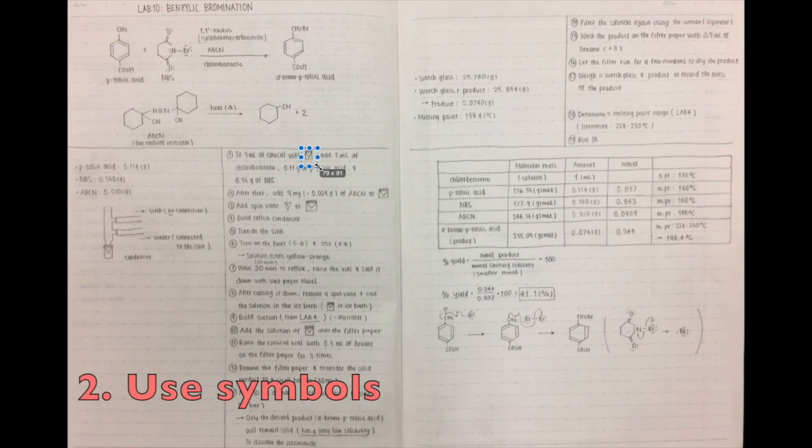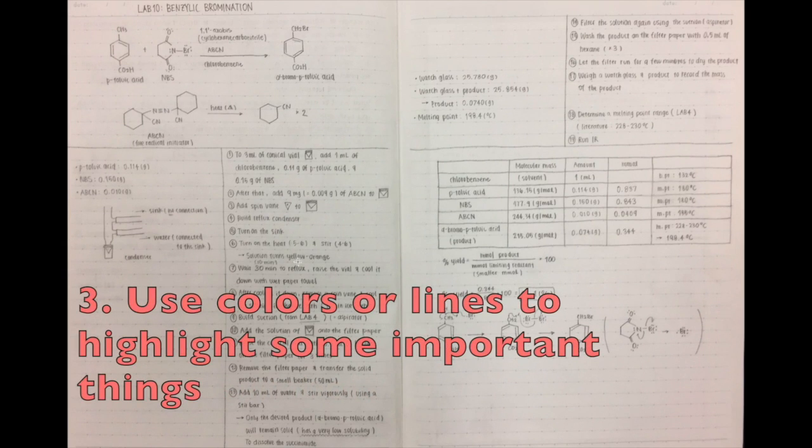Also, use some symbols in the notebook as written here. This makes the lab notebook more concise and easy to read. Finally, on this page it's not used, but it's a good idea to use several colors to highlight some important steps or ideas of the lab. In this example, the student underlines the essential idea to know in the procedures.